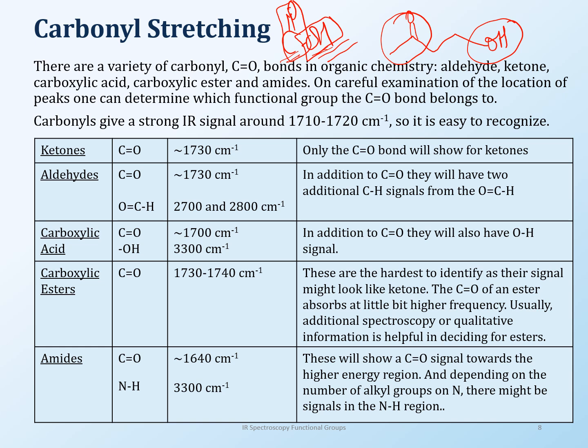Again, sometimes you need more than one technique. And then later on, I will show you the spectra for carboxylic acid. You can actually look at the IR and say, yeah, I got carboxylic acid. You can look at that and you can tell. So watch out for that when we get to it.